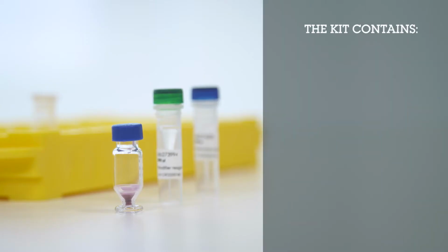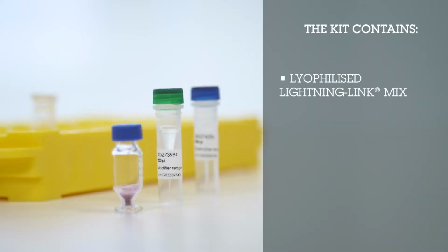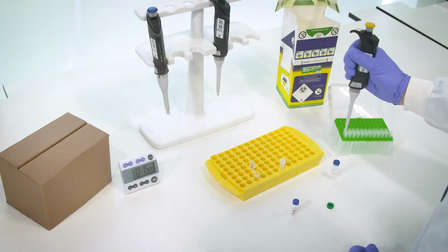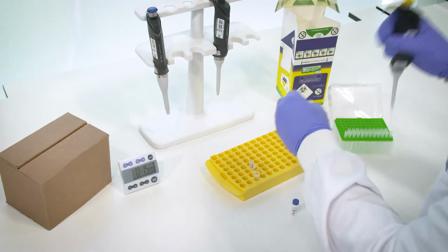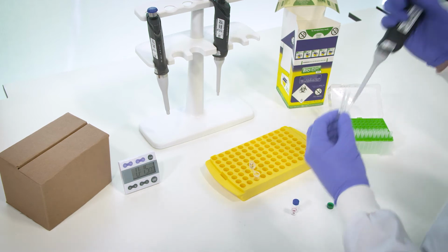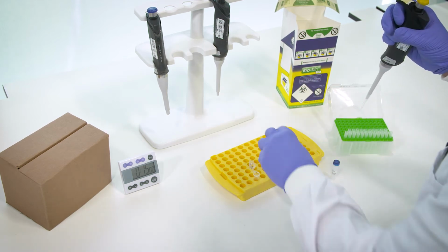The kit contains lyophilized Lightning Link mix, a vial of modifier and a vial of quencher. Simply add 1 microliter of the Lightning Link modifier for every 10 microliters of antibody that you want to label and mix gently.